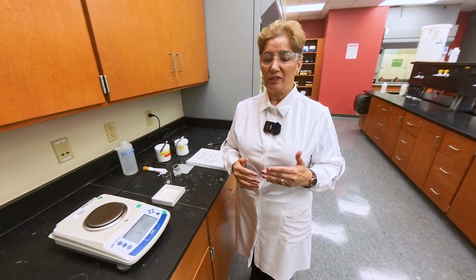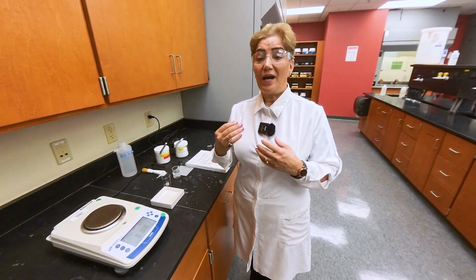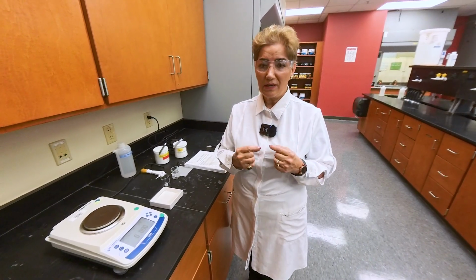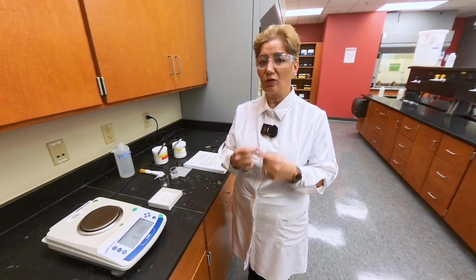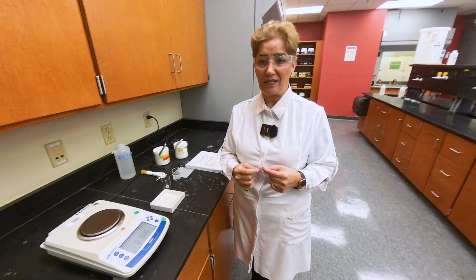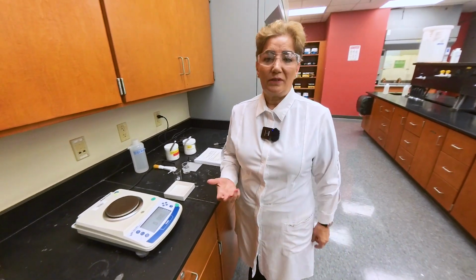So here are the orders. You read the experiment from the lab manual, then download the worksheet, then start watching this video. As I perform the experiment, you are going to look closely and record the numbers as you see them. Okay?